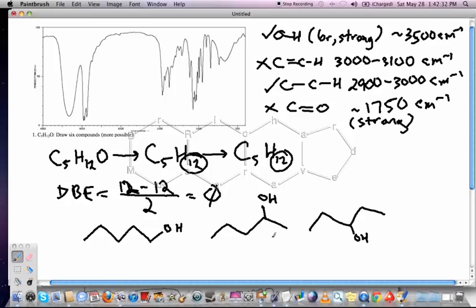But then I get kind of stuck, and I'm thinking about, well, what else can I do to form compounds if I can't use a straight chain like this? Or maybe you think of coming up with a branched chain. That's okay. Even this would be okay. 1, 2, 3, 4, 5. That would be fine too. So all of these are reasonable compounds, and we've got 6 of them. There's actually more possible.